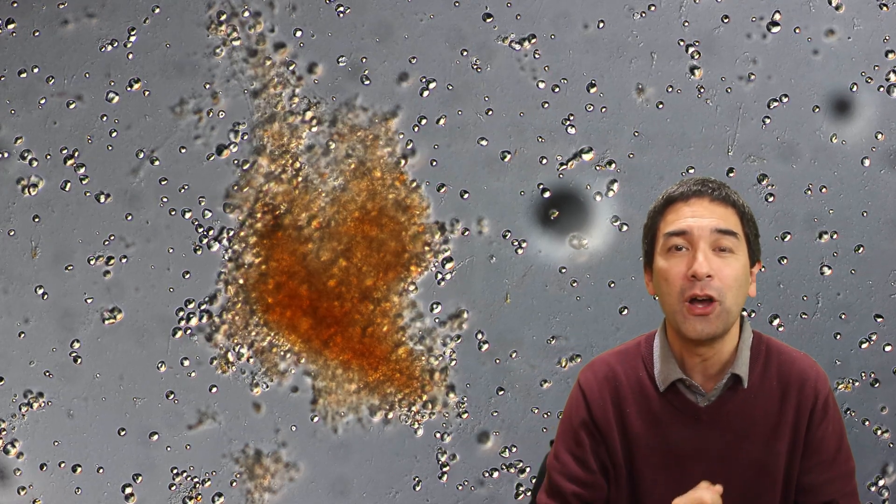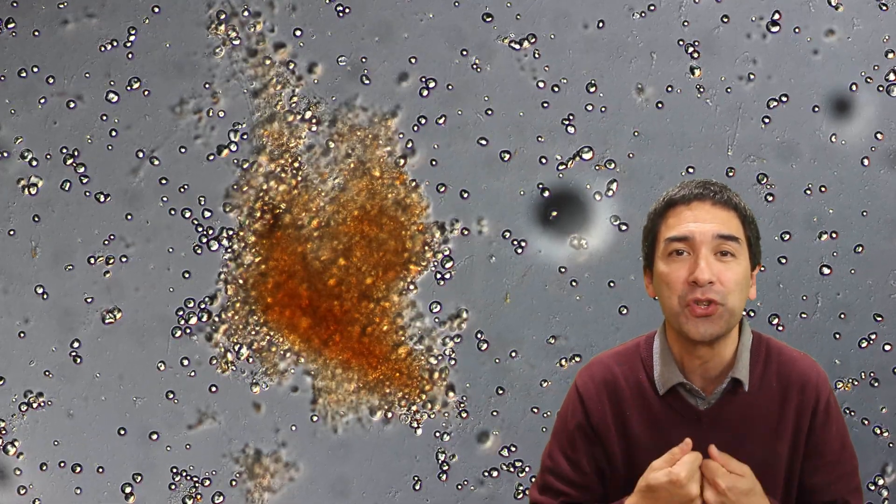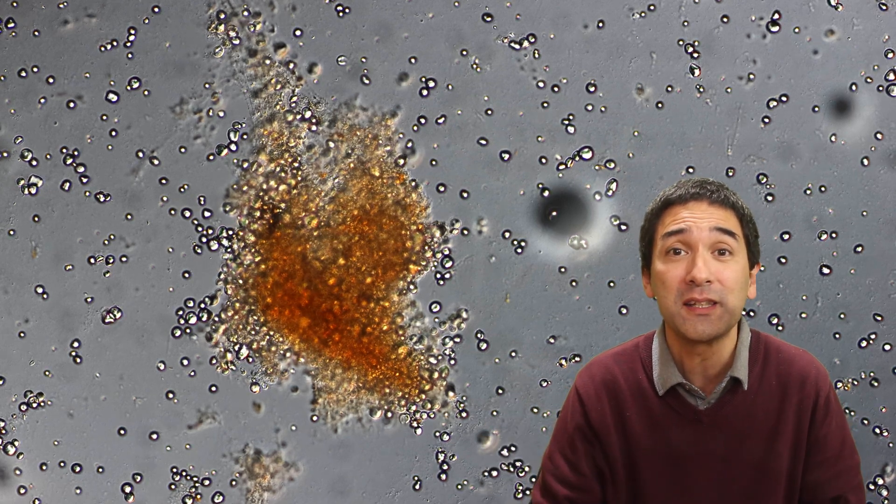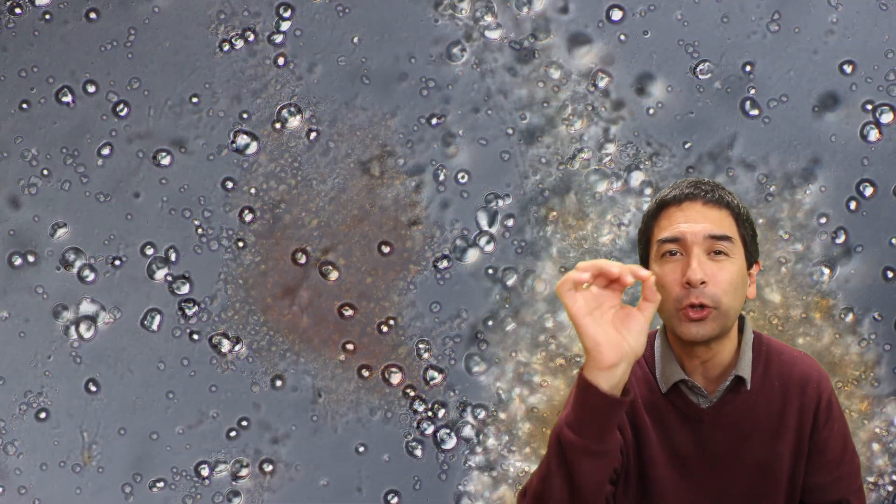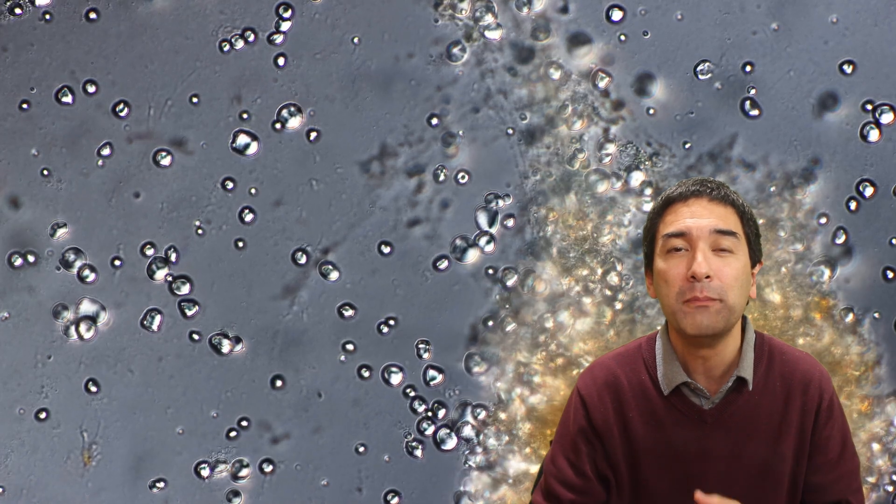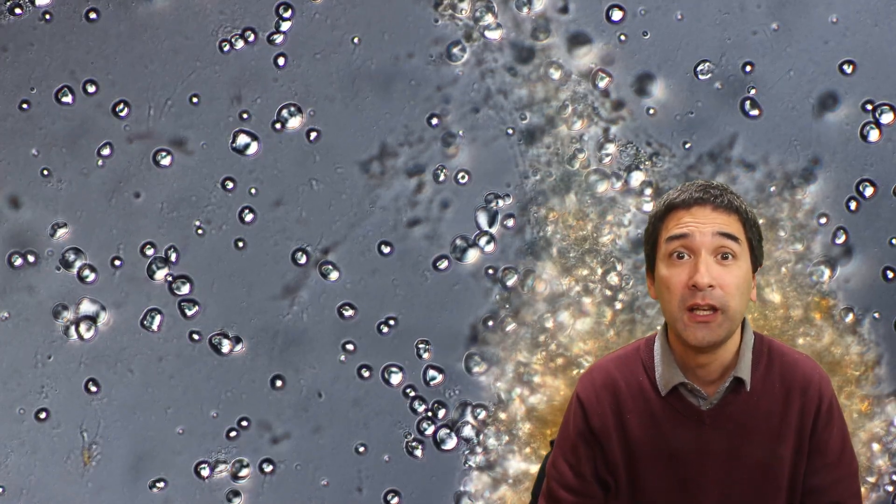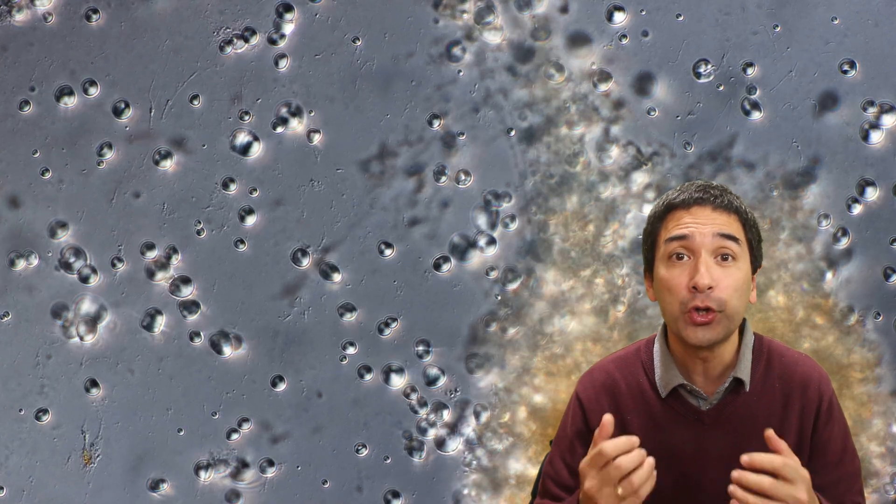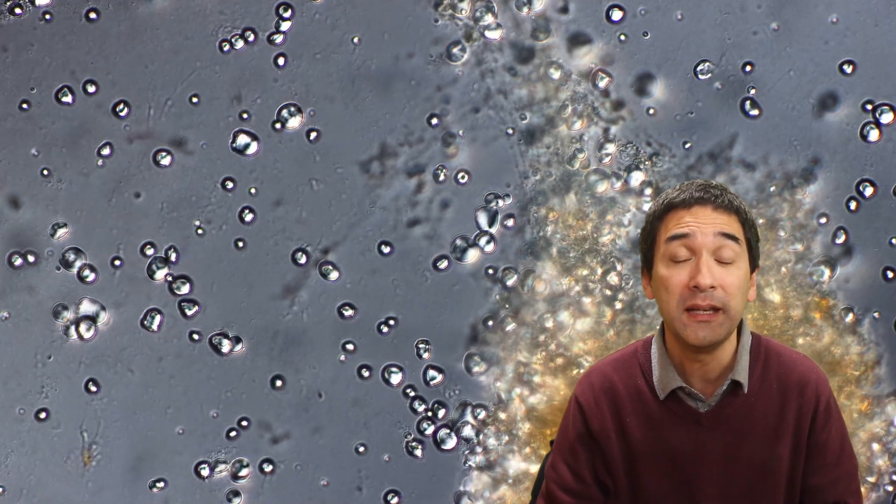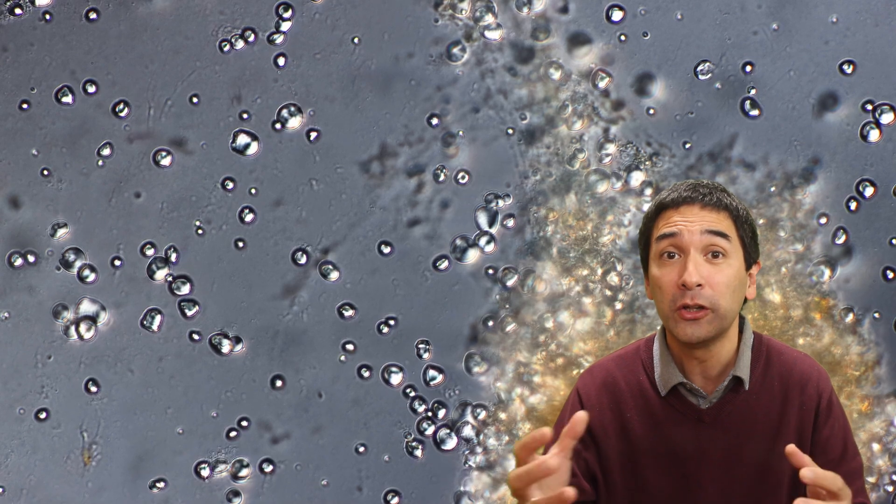That is the answer to the question. Those dots are our main energy source for pretty much all human beings in all cultures. Those little dots that you see over there are the main energy source. And what are they? Well, this is starch. Right now you're looking at the starch grains of a pumpkin.